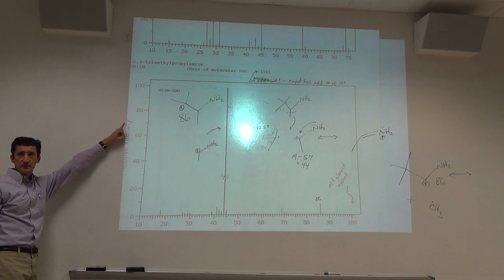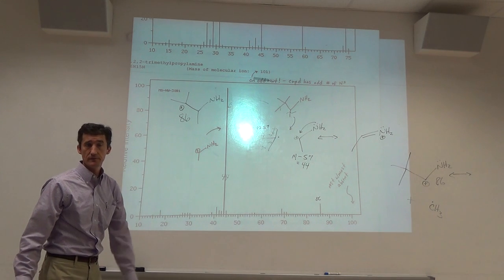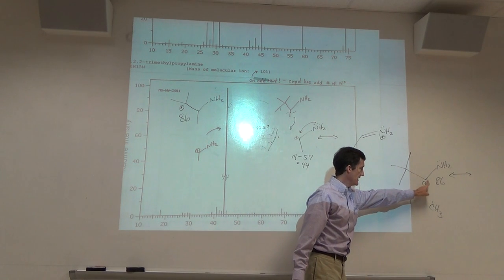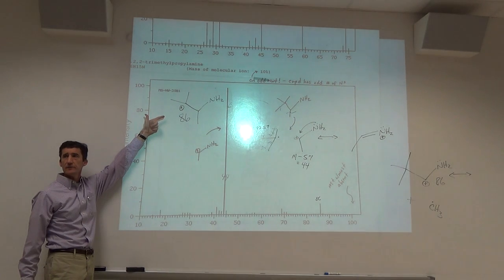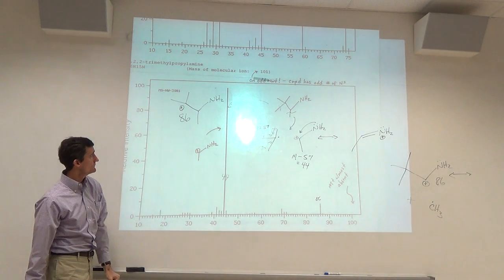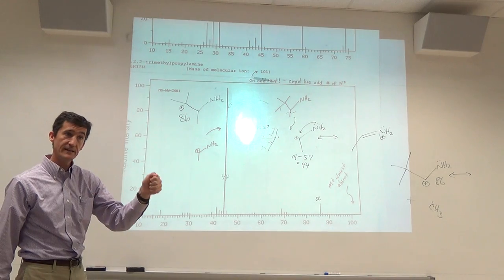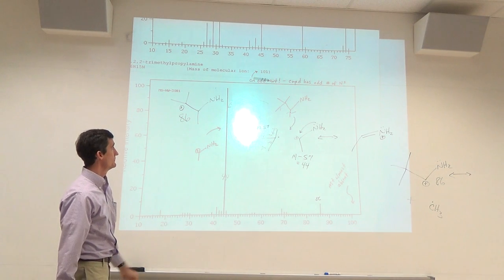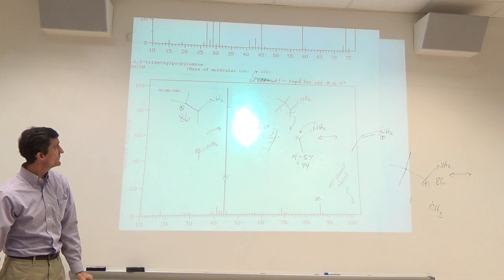What can you talk about the stability of that cation? It's not resonance stabilized, but it is what? It is tertiary. But typically resonance is better, even if it's not tertiary. But, like I said, there could have been another way to cleave a methyl. That would have been a reasonable proposal. Typically, though, we want to do alpha cleavage. Make cations next to what? Lone pairs or pi bonds. This is not too bad.